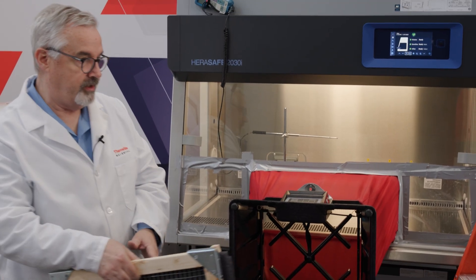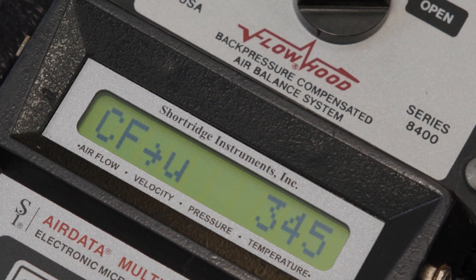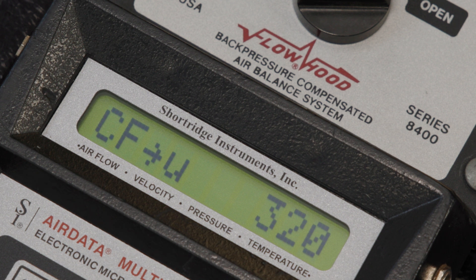If you would put it on top — we immediately see the inflow CFM drop to 325, 305, now 310, and it's holding at 310 and begins to recover. At the lowest it was 310 and our downflow was still at 61. We'll wait and see how much it recovers back up to that 350. Now it's at 325, 330, 340. And this is the airflow compensation on the exhaust motor — 345 and 350.